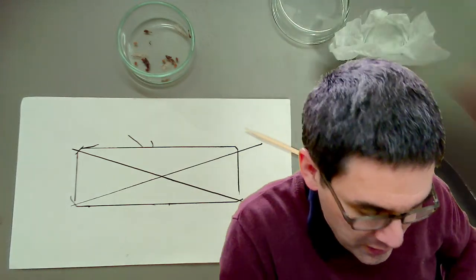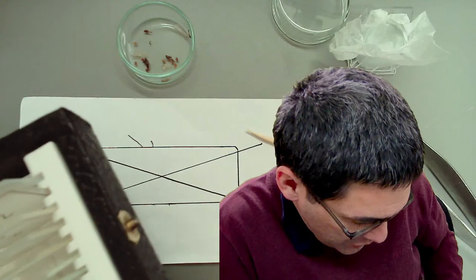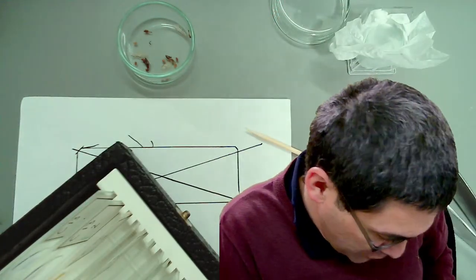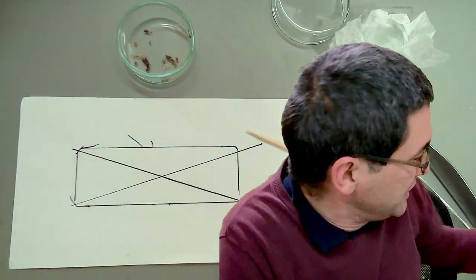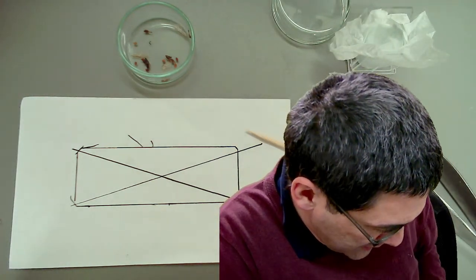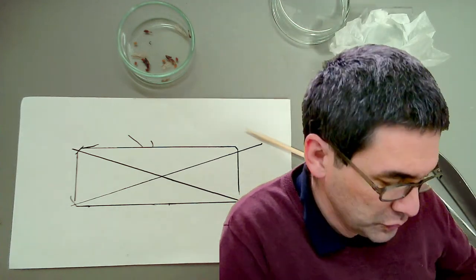Now this is actually a good time to talk about this. I've got a slide box here, a commercial slide box. Now this is not such a nicely made one. Look, this looks kind of ugly, right? So let me just show you a nicer one. I've got another slide box here. These are not slides that I made, these are commercial ones. And this is now the real reason why you use round cover glasses.